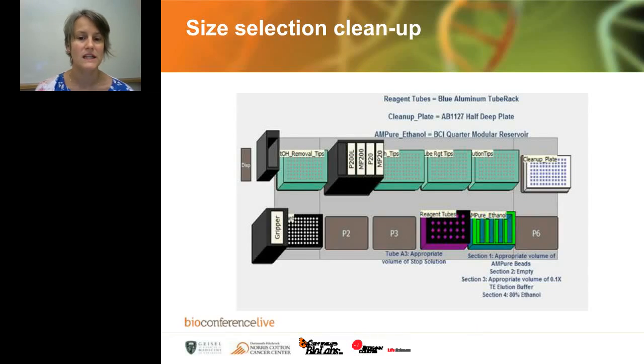So we use the XP beads for cleaning up the reaction, and we did this in a reservoir. There is a little bit of overage that you need to account for when you're using the reservoirs, but this was reusable. We made sure that everything was sterile before we put it in so that we could reuse any unused beads or ethanol that we put in the reservoirs.